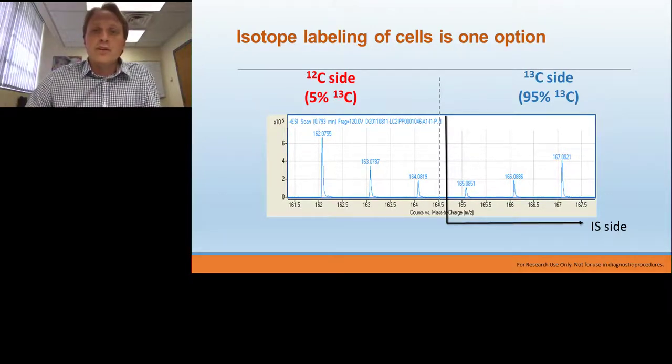And if we look at what's here, on the left side, you have a carbon-12 side. This would be carbon-13 glucose fed at 5% labeled, and that would produce a descending isotope pattern that increases the carbon-13 abundance by a significant amount, so we can measure it better. When we combine both of these together, with the 95% carbon-13 and the 5% carbon-13 labeled, we get a U-shaped pattern that produces a non-natural isotope effect. And so on the right side is the non-natural aspects, where we have an M-1 and M-2 that would not be normally present in the given system.